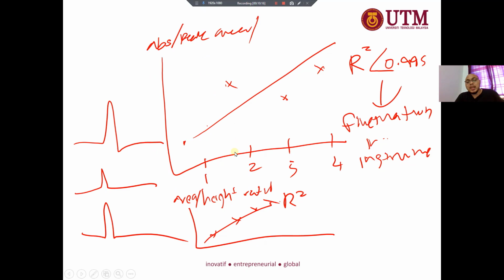If, for example, you perform the analysis of a complex matrix sample and you have the problem of fluctuation as well, you need to combine the internal standard method and also the standard addition. That is a very tricky situation, when you have a complex matrix and at the same time you encounter fluctuation of the instrument reading.